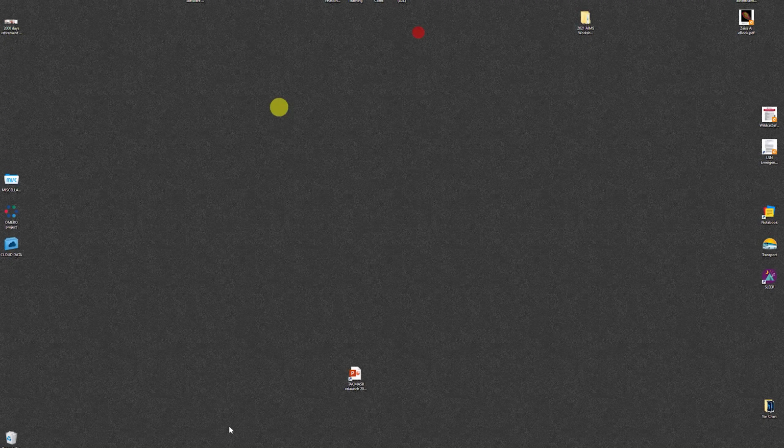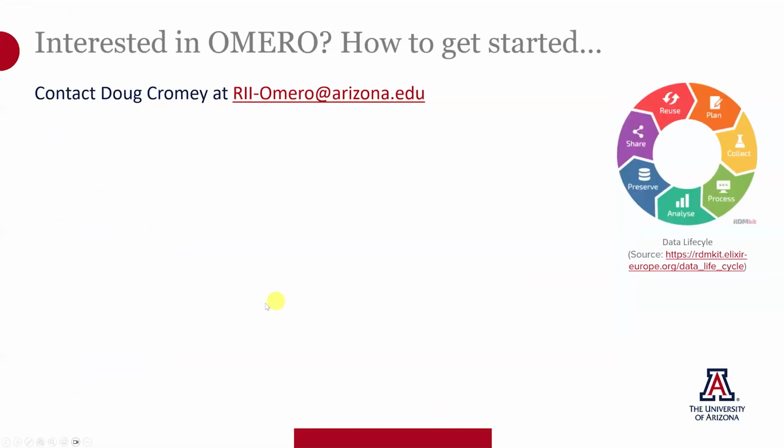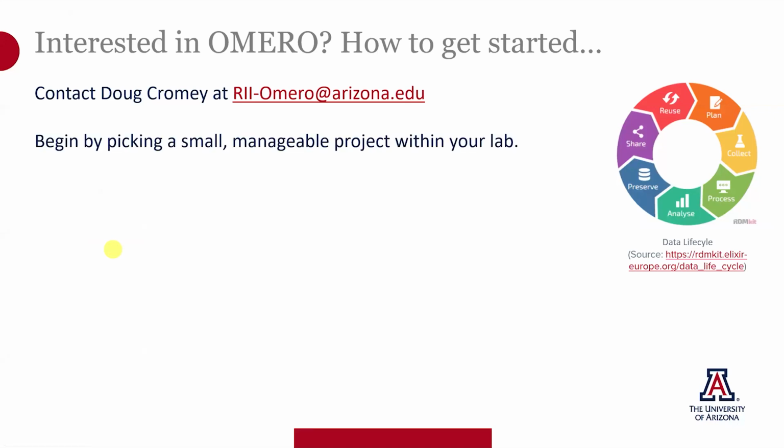Let's go back to our slideshow and wrap things up a little bit here. If what you've seen about Omero is interesting to you, send us an email at our project email. I encourage you, if you're thinking about Omero, to consider starting with a small project that's manageable.